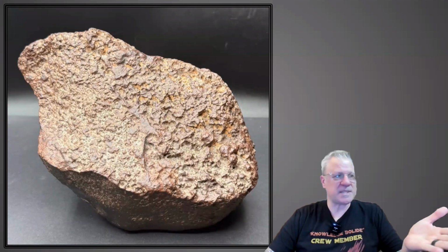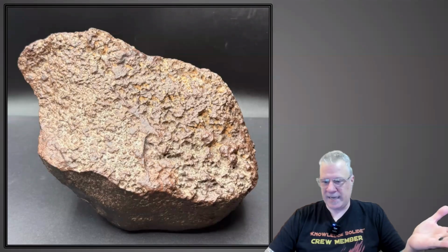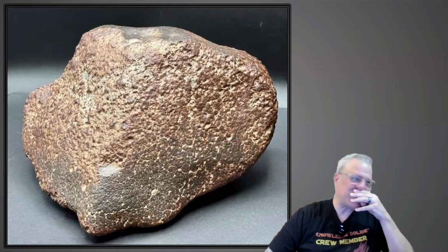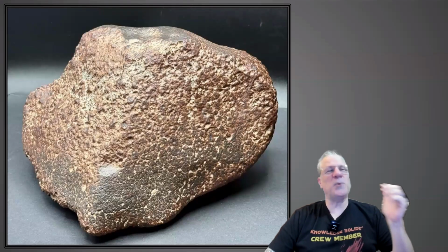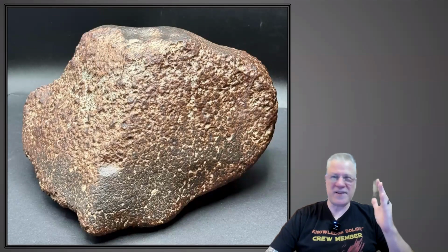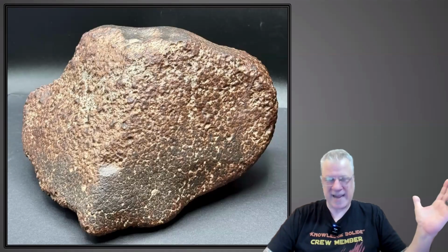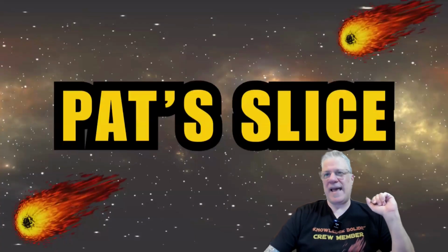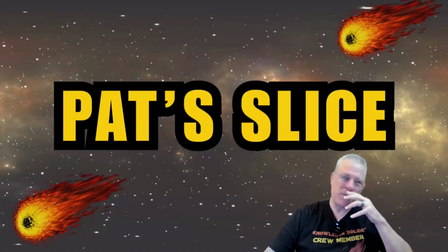This is the main mass, and it is no longer a whole stone. These are the only pictures ever in existence of it as an intact main mass. Sue is in the middle of editing these pictures right now, but I wanted to point out some interesting things that we saw on some slices.